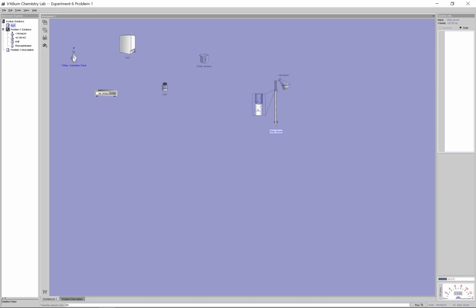I have made a solution where I know the concentration, but in science we want to do repeat trials if we can. I don't want to titrate this NaOH directly against all of the 100 milliliters. Nicely, concentration is something known as an intensive quantity here. If this is a picture of orange juice and I pour it out into a couple of different glasses here, the taste of the orange juice in the glasses will be the same as this entire picture here. Concentration stays the same. So what I'm going to do here is pull out a couple of Erlenmeyers.